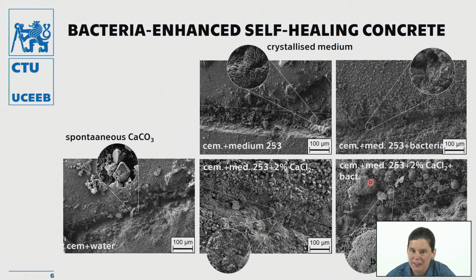And these images, they are the pastes based either on the medium or medium with bacteria. And you can see, if you compare these two images, especially these two details, there is a significant difference between the size of the crystals formed.